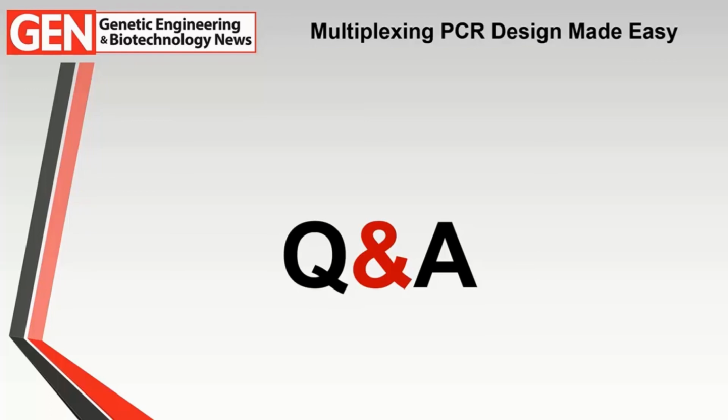I just want to add one thing, John, to what you mentioned, and I think it was left out of the presentation: you also have to know your enzyme and your master mix. There are some myths that people have, that one of them is better than the other, or that I like this kind of enzyme mix because I have been using it in the lab for a long time. That is also something you need to be careful about. Whether you have 3' exonuclease or not has a tremendous effect on the multiplex. And when you look at the interaction of the primers and everything, you have to be careful about it. Sometimes people forget about it and just stick with the one that they had, so you have to be careful, right?